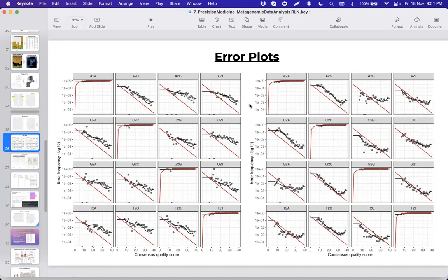Okay, so what does this actually tell us? It checks possible error rates, right? For example, if you have this for one file, you'll get a plot like this, right? This is generally good error rates, except for a couple of places here and there. So that's generally what you will see there. If you see the trend that is followed, that's good.